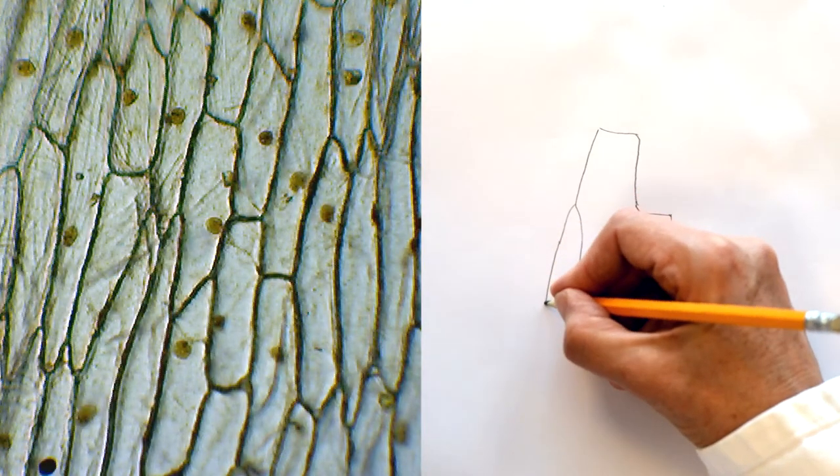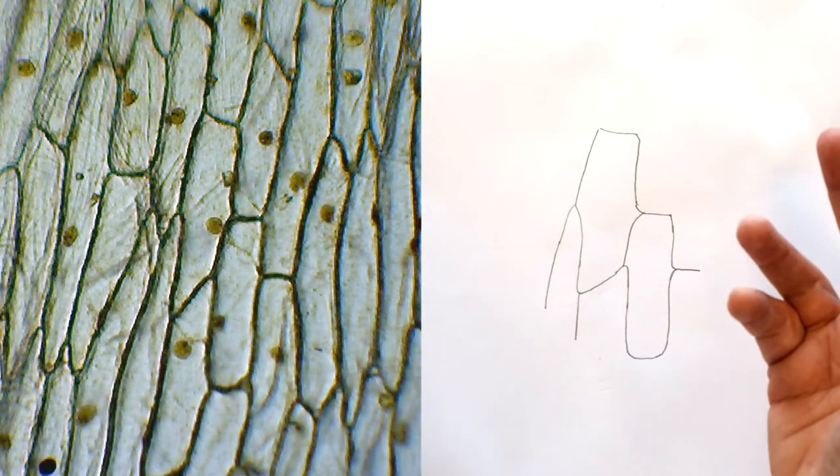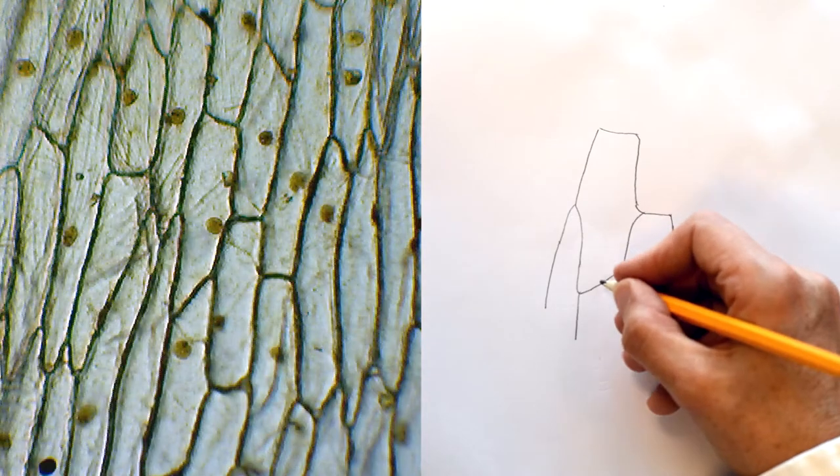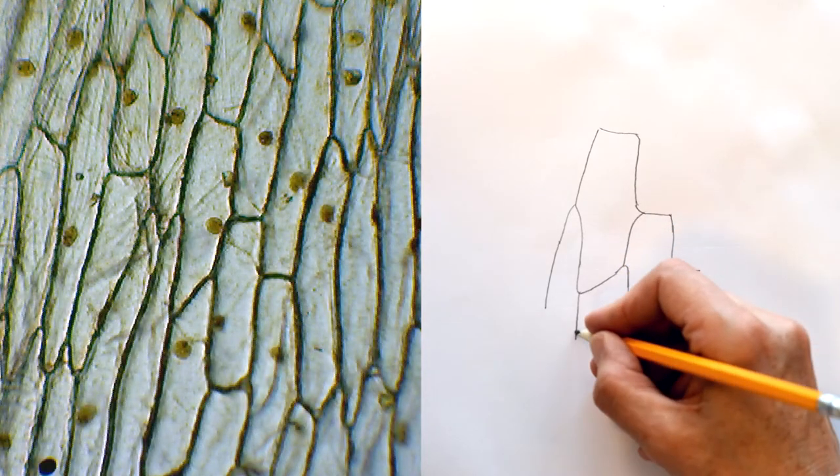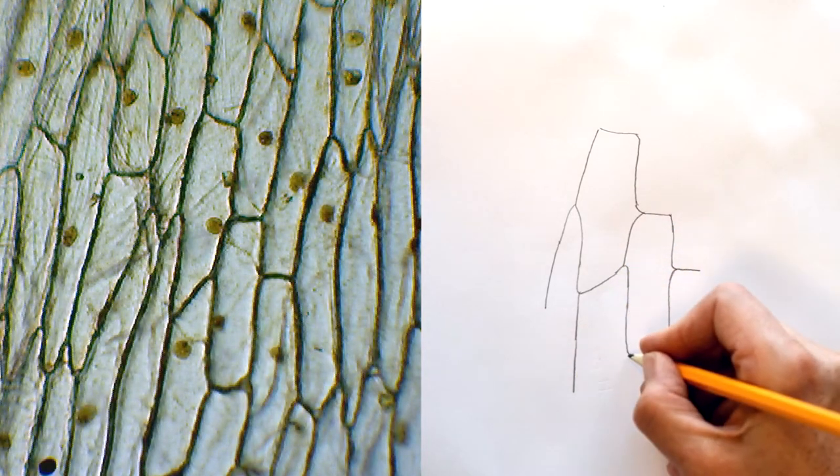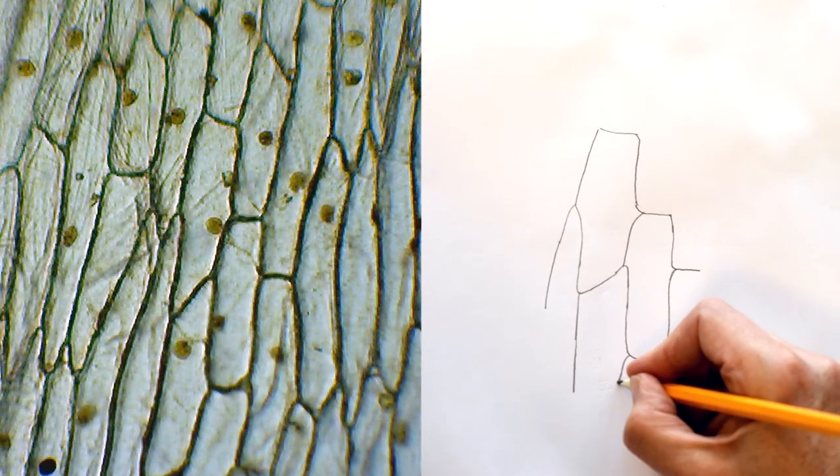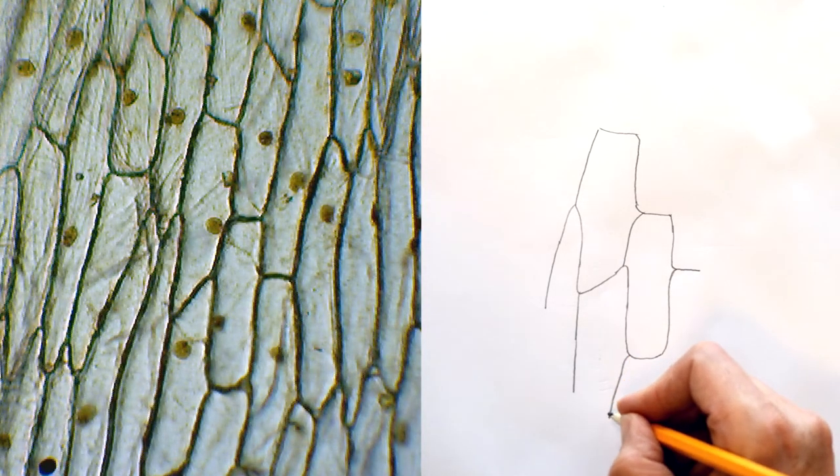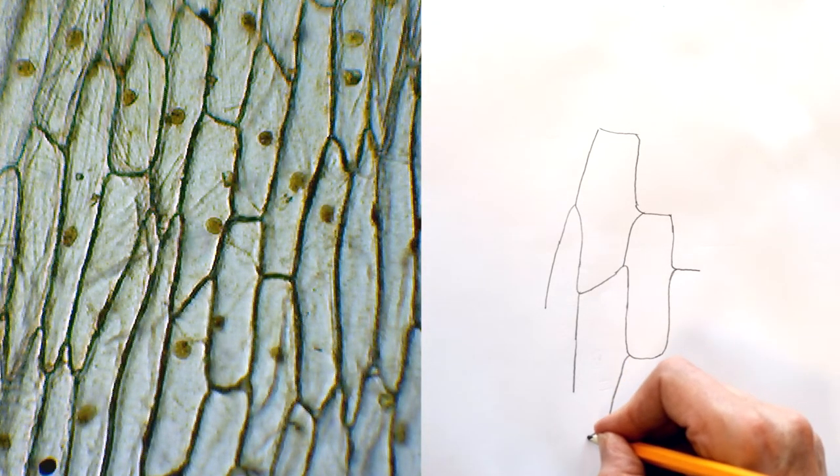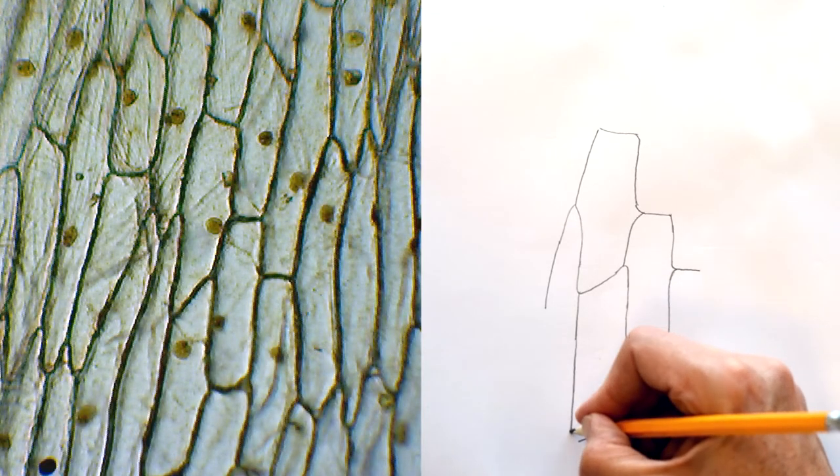So I'm going to carry this one down but I'm not going to do the entire of that one, I've no need to. I'm going to carry this one down and I'm going to finish off this cell because it too has that nice little nick to the side but look at that end wall, that last end wall of it. It's not straight, it's at an angle.